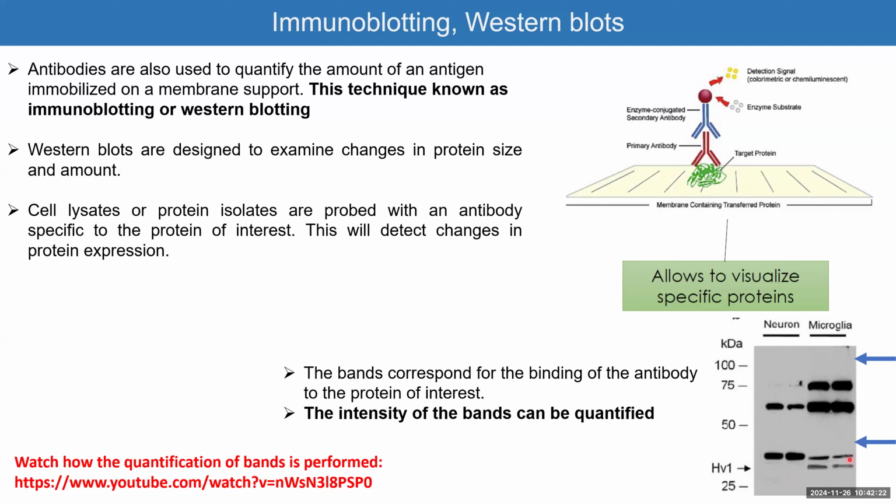And if you look at this protein here, it's the inverse of that. So this protein is highly expressed in neurons and lower expressed in the microglia. So you can tell based on which antibody you used if the expression is higher or lower based on the conditions. And you can make any different scenario here you want. You can say these cells are not treated with something and they're treated with a drug, and that drug is inducing a protein expression.